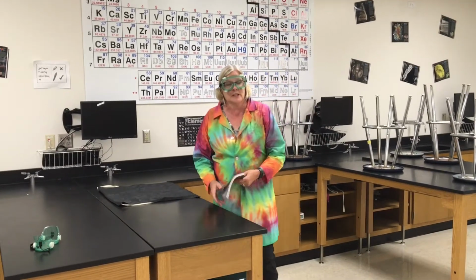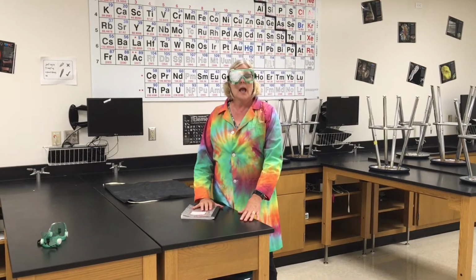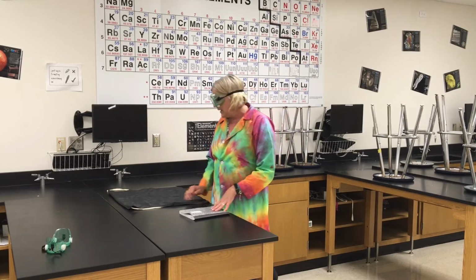Another thing is what you bring to the back: no food, no water, no drink, no cell phones will be in the back. And so we want the area clean. If there's ever fire, you don't want anything that's going to be catching fire. But you know what? Your teacher's going to tell you what you specifically can take.